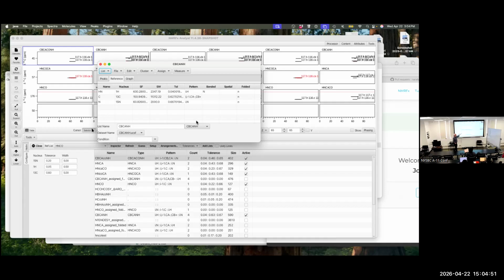So the CBCA NH experiment can go from the HN to the CA and CB of that residue, but can also go through a two-bond coupling to the previous residue. In the I minus one experiment, like the HNCO, you can write the pulse sequence to explicitly go through the carbonyl, so they're unambiguous. For experiments to get the I, the same residue, because it is a weaker two-bond coupling, you can also pick up more weakly the signal from the previous residue. And you can write these experiments.